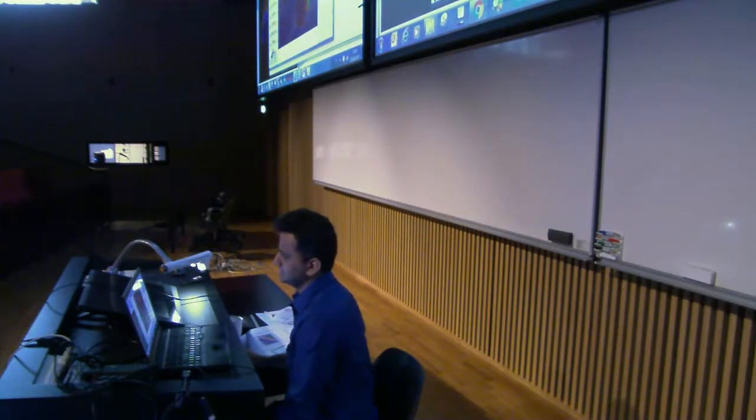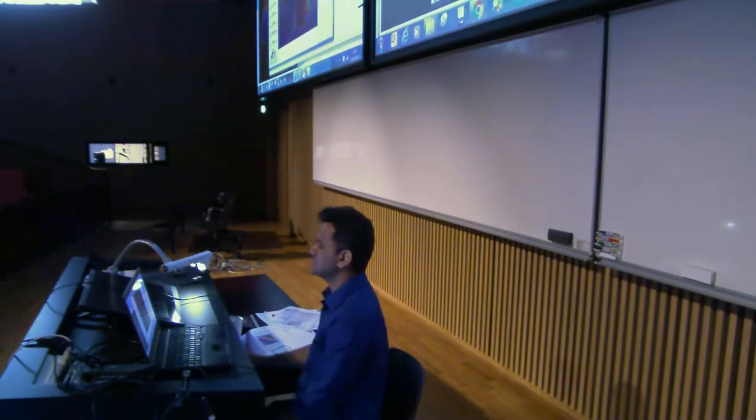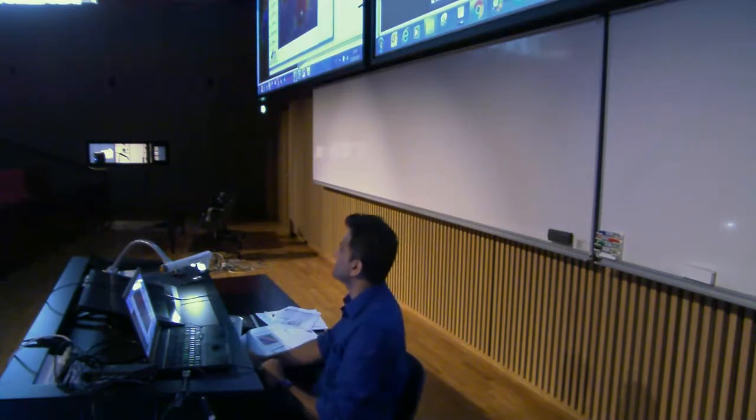Do you agree? Well, not bad actually. At least the nuclei segmented nicely. That's the red part, right? It's the red part here. The green one is the other channel, and the magenta is this one here. Not really perfect, because we haven't selected a proper region of interest.